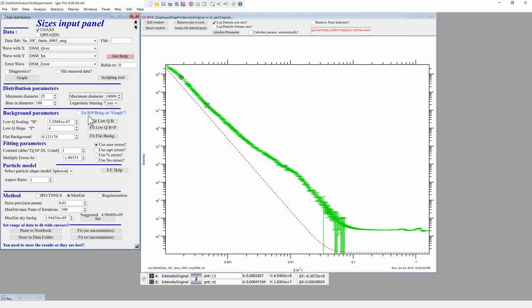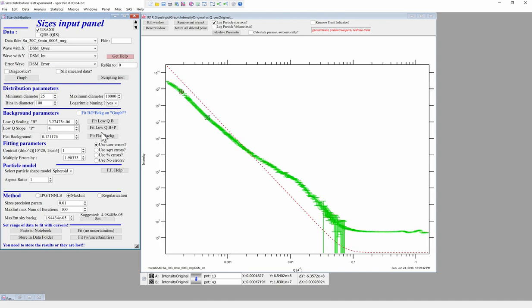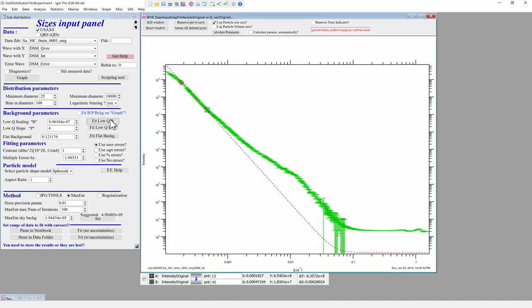range of sizes again. Now I can fit this with the power law slope, and let me try this. First thing, I don't believe this slope here, for various reasons. Up here, what you can see is that the power law slope is approximately 3.83. It's not exactly 4. If you use 4, it's not going to be a perfect fit. It's going to be slightly steeper than that.